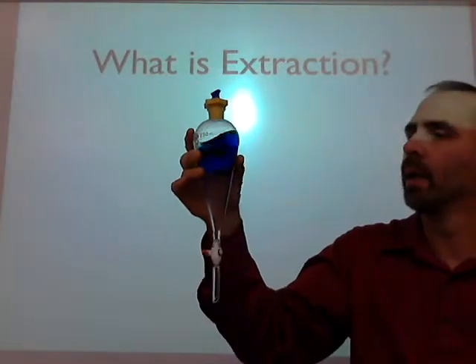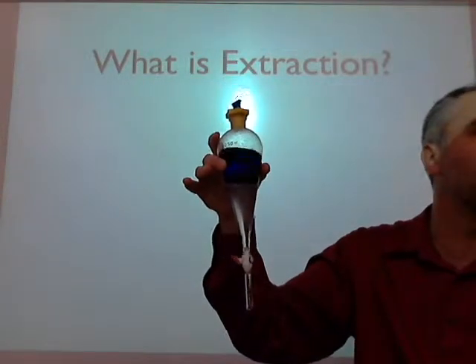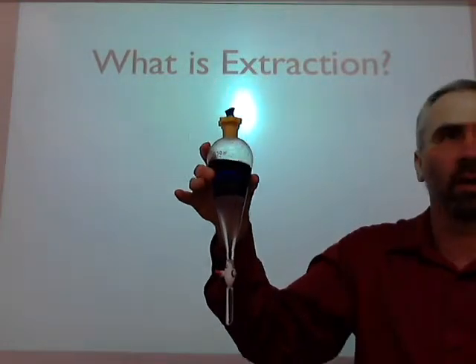2,6-dichloroindophenol or something like that. You don't have to worry about that. But notice it doesn't separate out. I got that color in there so you can see that. You won't see that in the lab tomorrow, because it's basically going to be invisible.